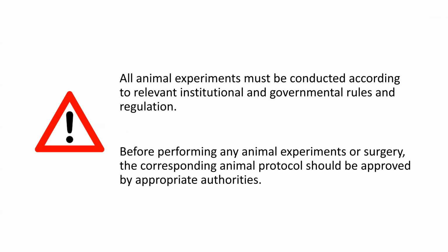All the animal experiments must be conducted according to your institutional or governmental rules and regulations. So make sure that before you perform any experiments on animals, your animal protocol is accepted by the appropriate authorities.